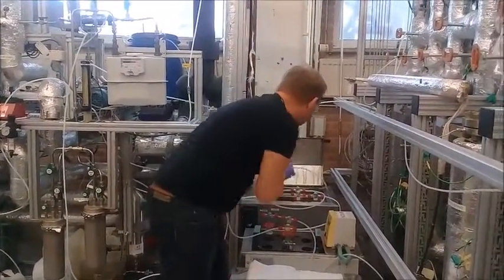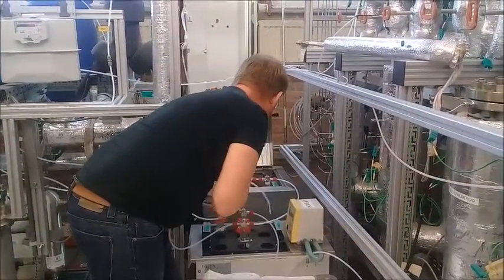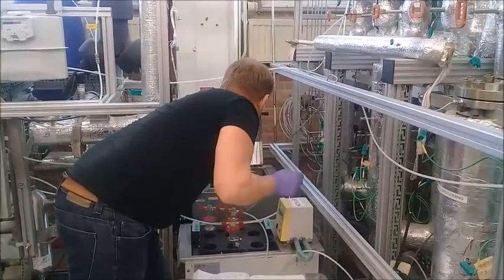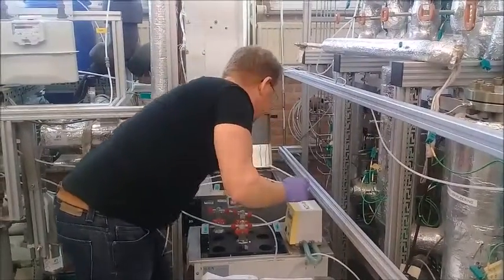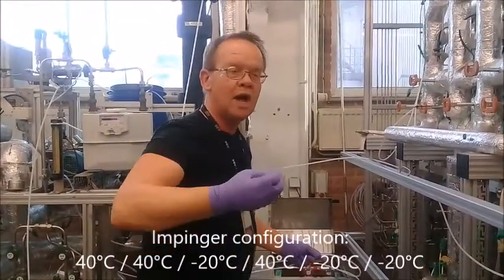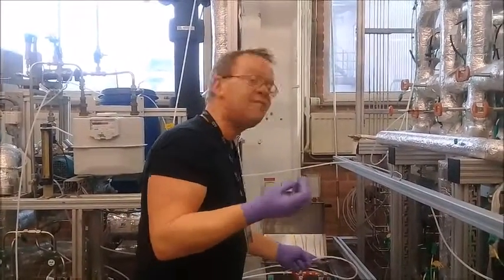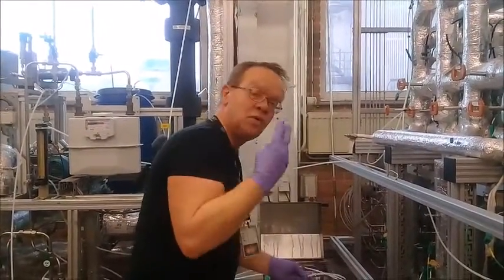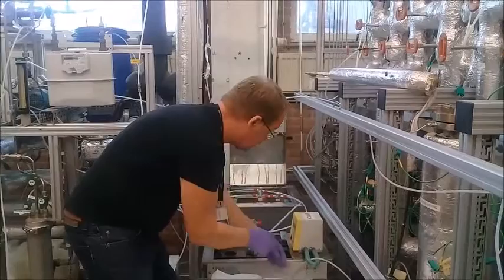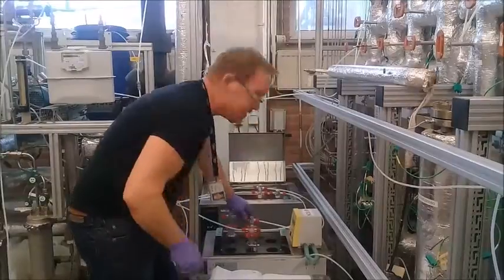So I'm going back to the 4th washing bottle. There it is in. And the 4th washing bottle is again at +40 degrees in order to heat up the extra aerosols, in order to extract all the left aerosols into the final 2 washing bottles in the glycol bath, which are these 2. So everything is tight and fixed.